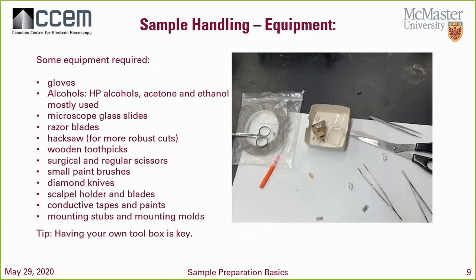Now, some of the equipment that you need, because you have to get familiar with your lab before you can begin to prepare samples, is gloves and alcohol, especially for TEM. You want to make sure that you have high purity alcohols to get as clean a surface as you can. We usually use HP methanol for TEM samples. Acetone and ethanol are usually the standard for surface cleaning.